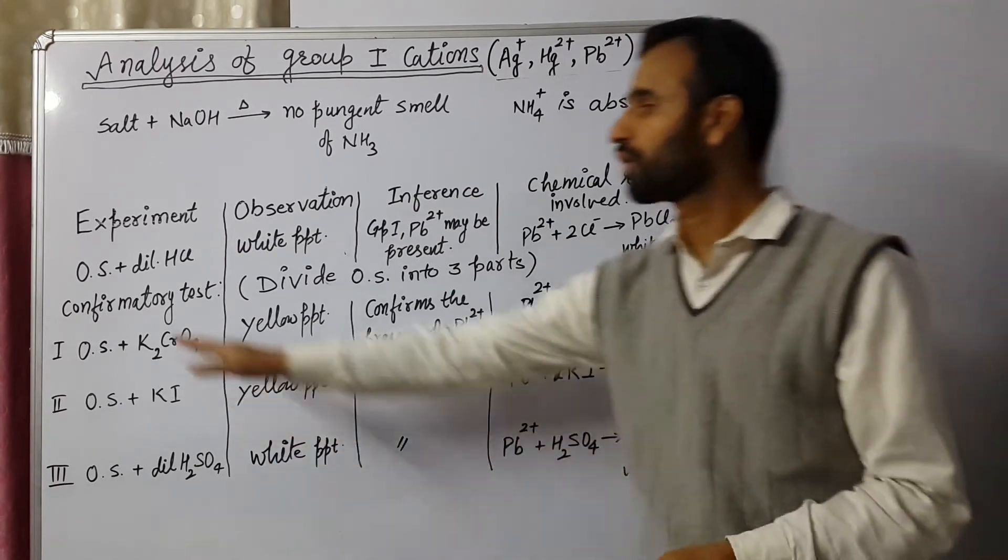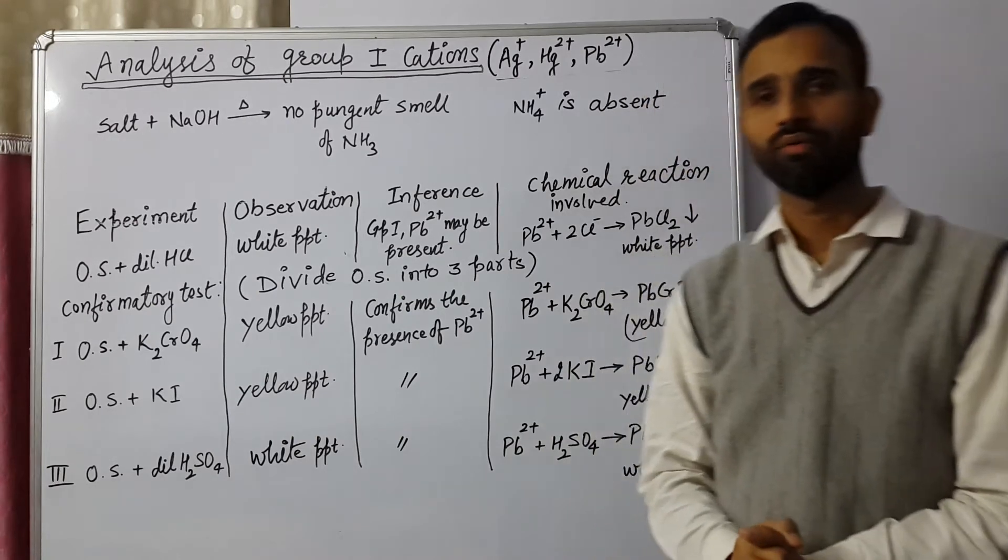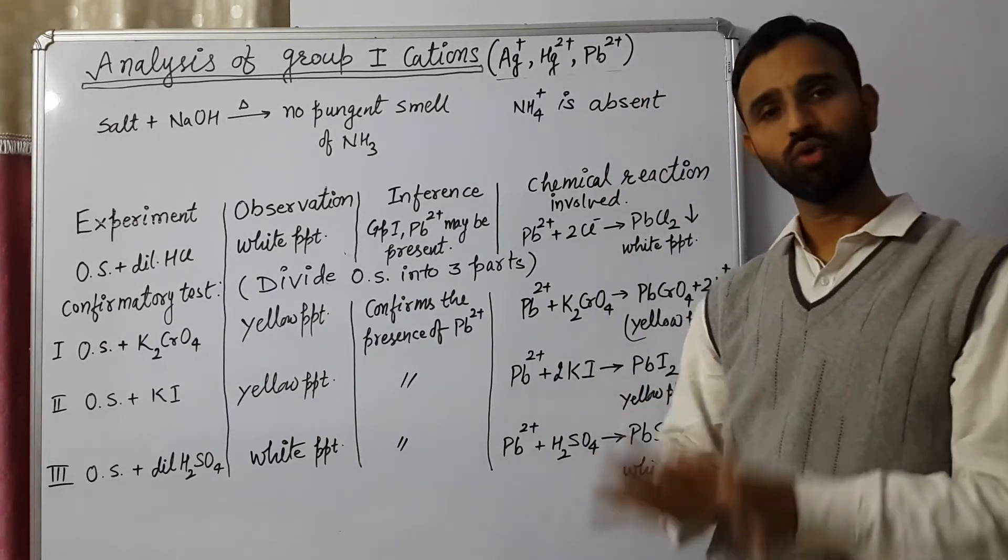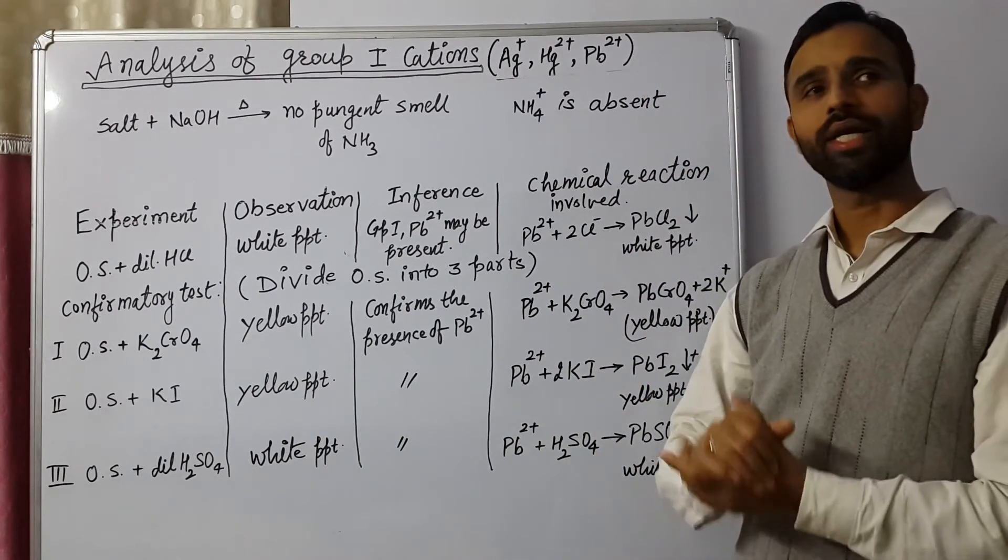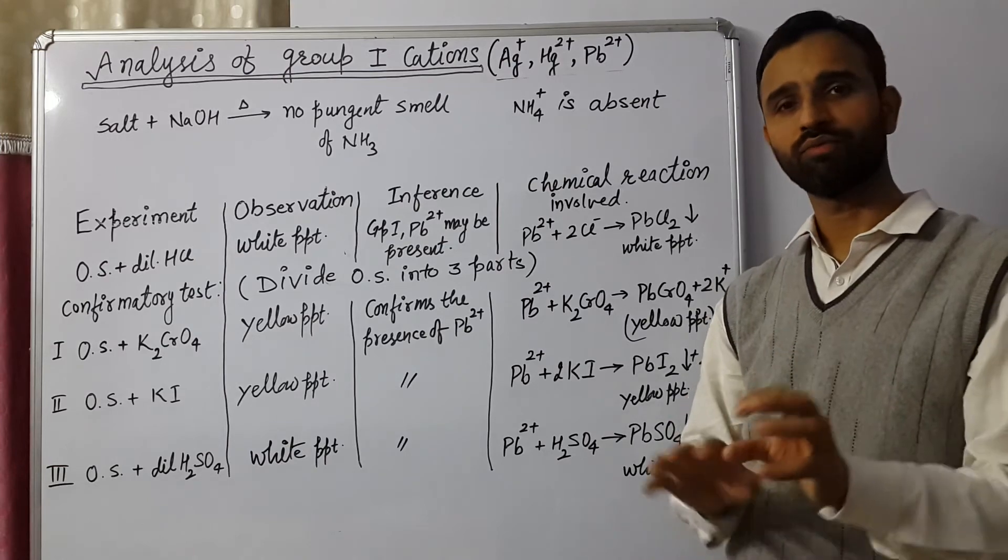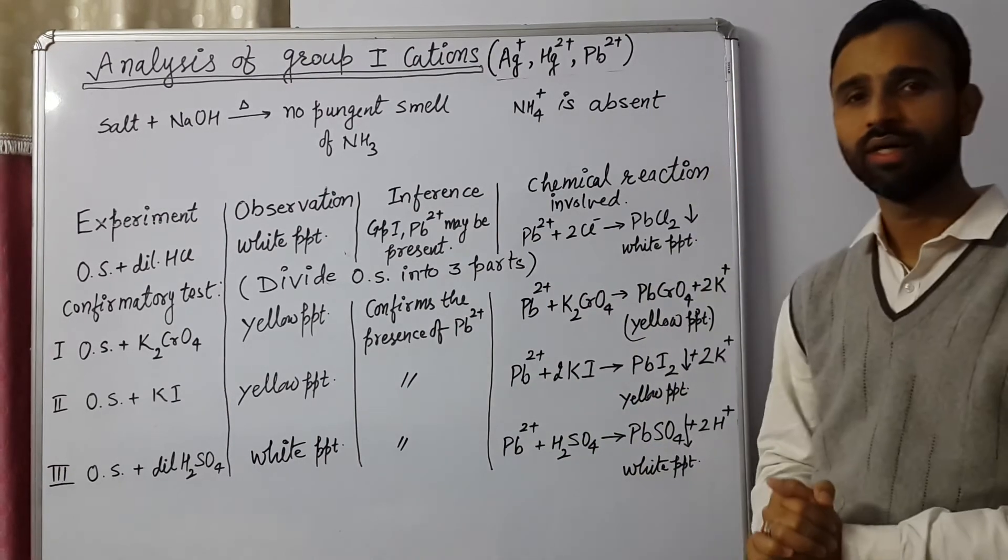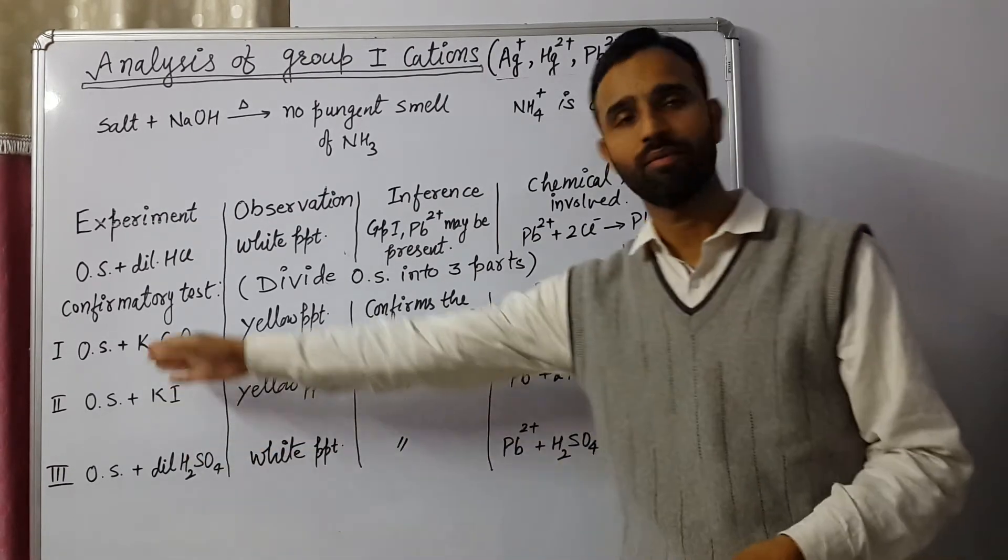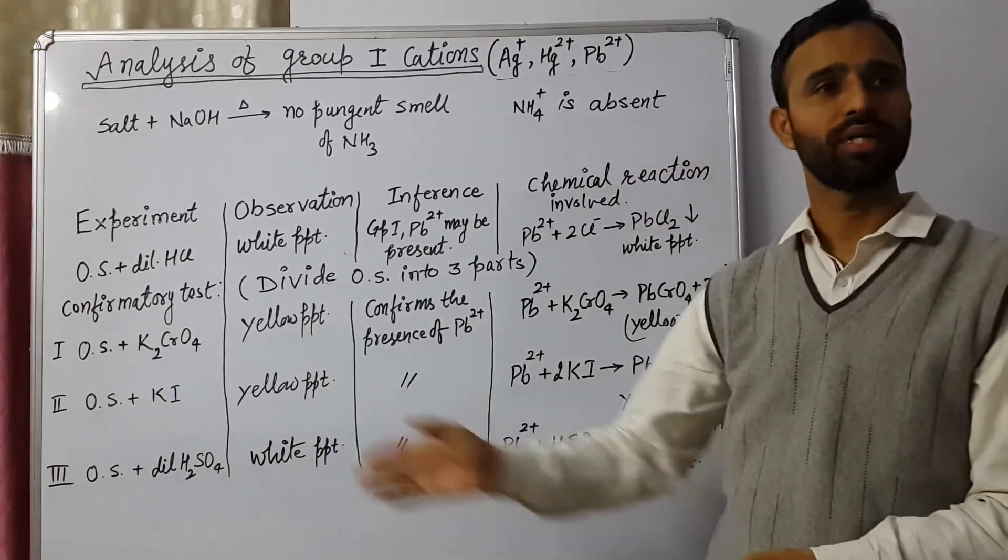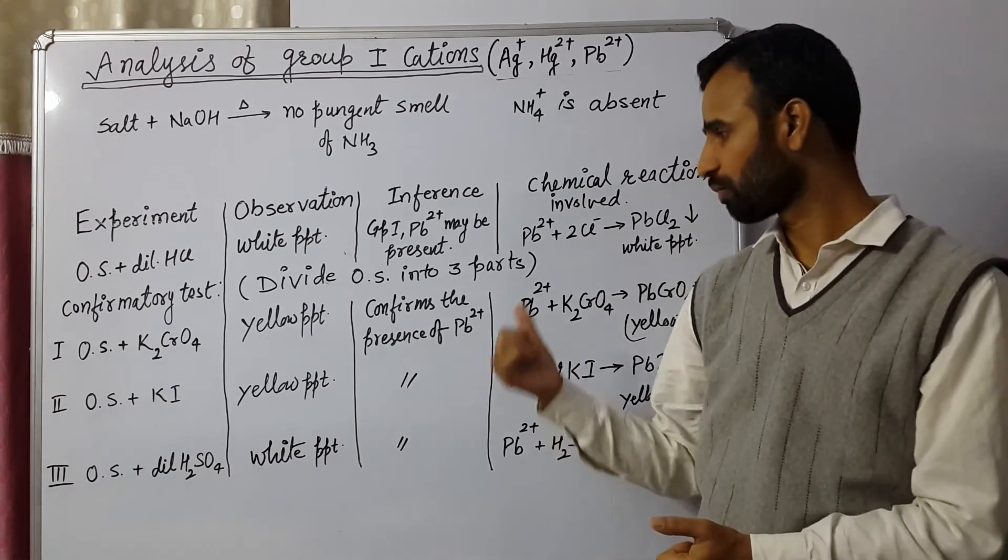Then we go for confirmatory tests. For that, again we prepare OS. And that OS, we divide into three parts in three test tubes. In first test tube, we add potassium chromate, yellow PPT appears. That is of lead chromate. You can see the reaction.